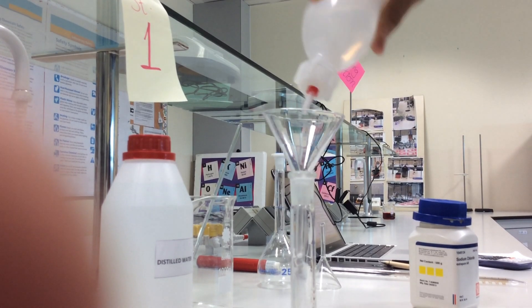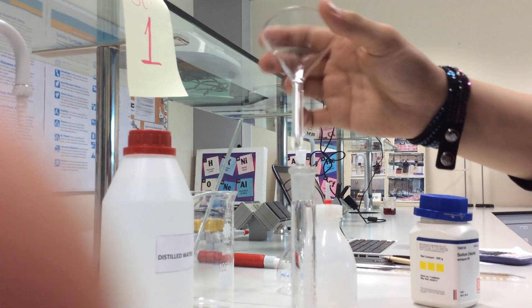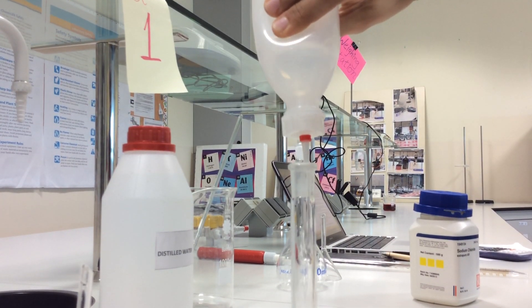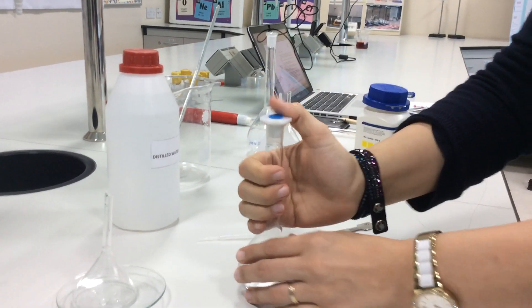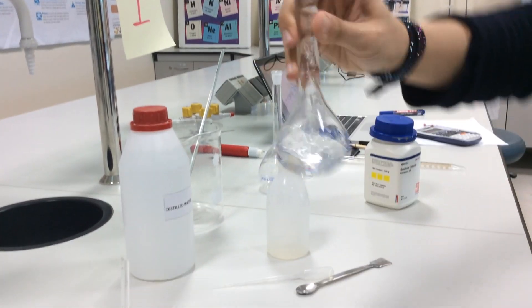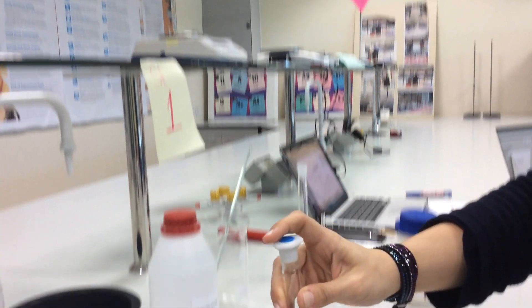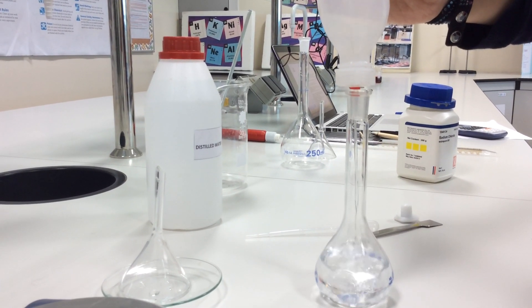Now we will close this wash bottle after adding enough amount of water, and then we will stir just to dissolve all the salt. Note that here I am not adding water until the mark. I will shake the volumetric flask very well just to make sure that all the salt is dissolved. As you can see, no more salt remains undissolved. Now slowly I will add water to the volumetric flask until the mark.